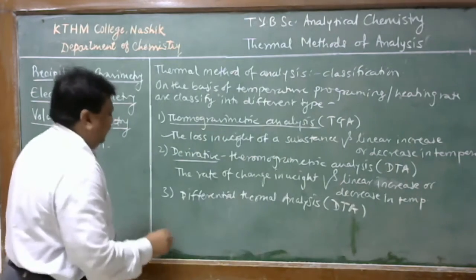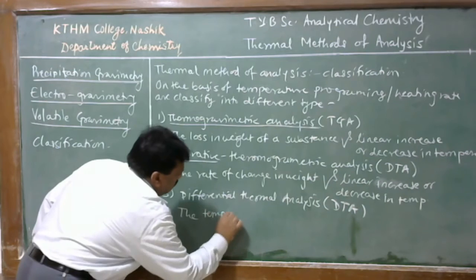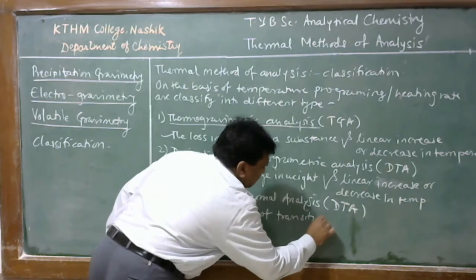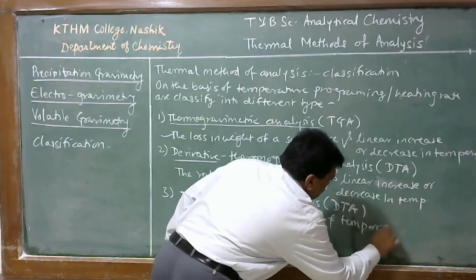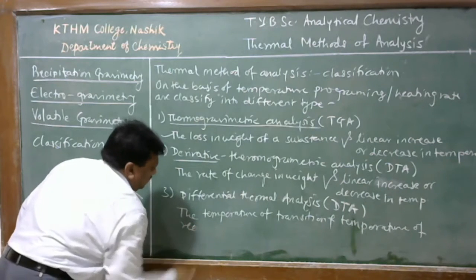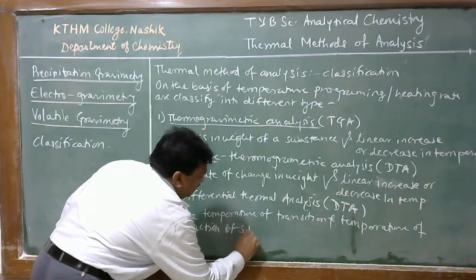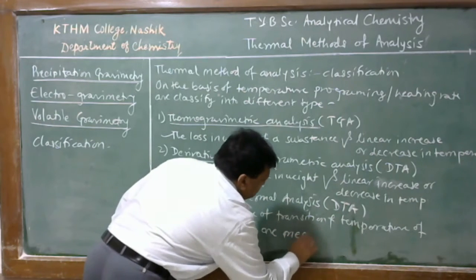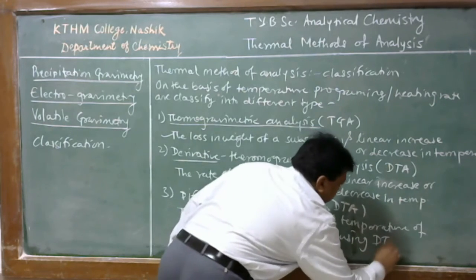In this case, the transition temperature, the temperature of transition, and the temperature of reaction of a substance are determined or measured using DTA apparatus.